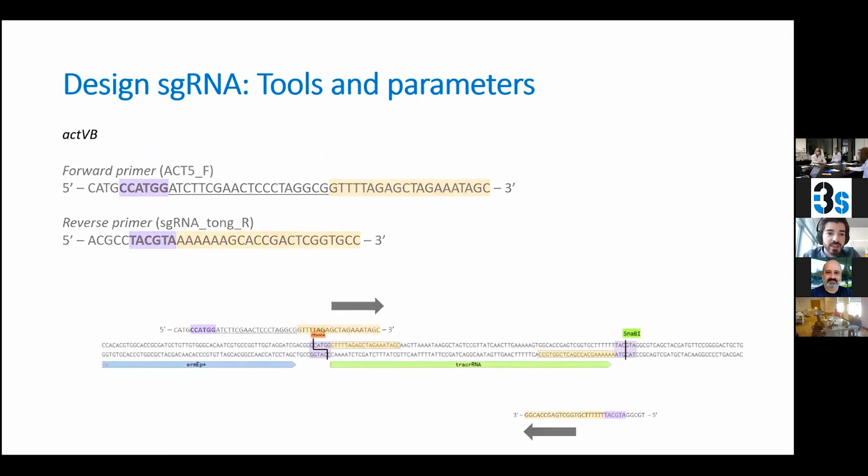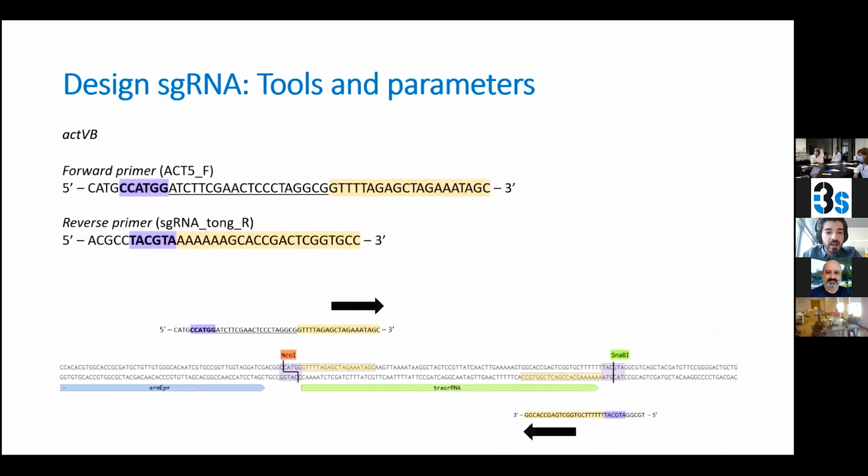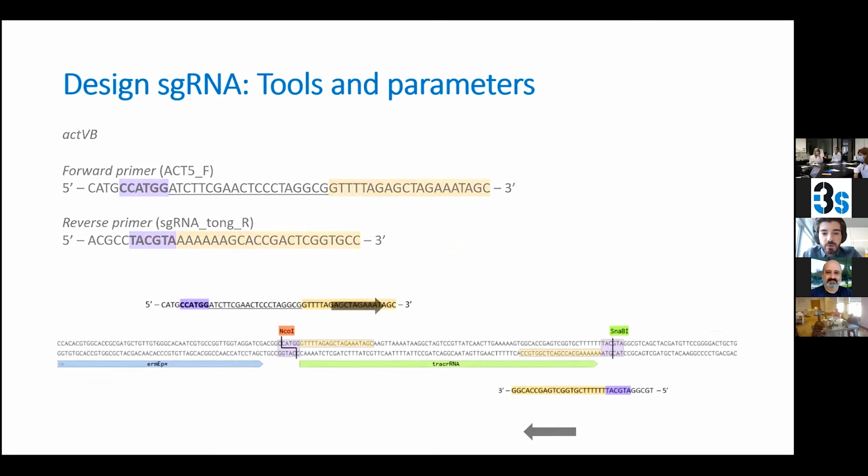Okay, so we basically started with this guide, and this is something that we buy. Nowadays we can synthesize DNA. This would be a different talk. We can synthesize very big chunks of DNA even, and especially in microbiology that has given results to many interesting data. But we basically just synthesize these very small fragments. This is 18 or 20 nucleotides. We buy them for like €3 or something. And we are just cloning them using a PCR.